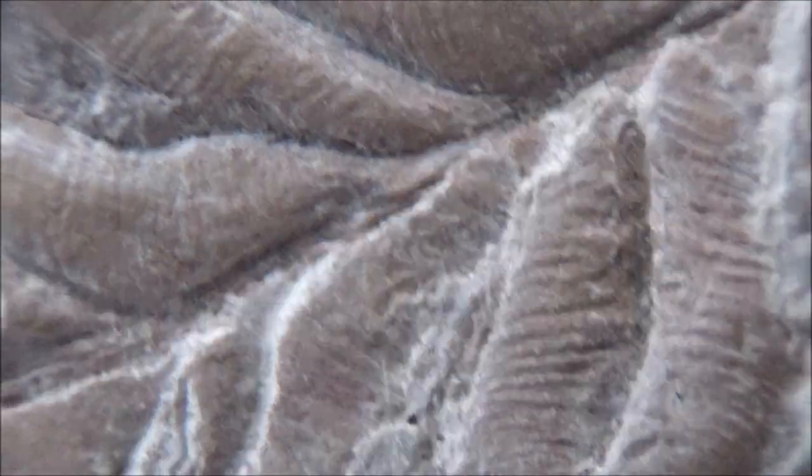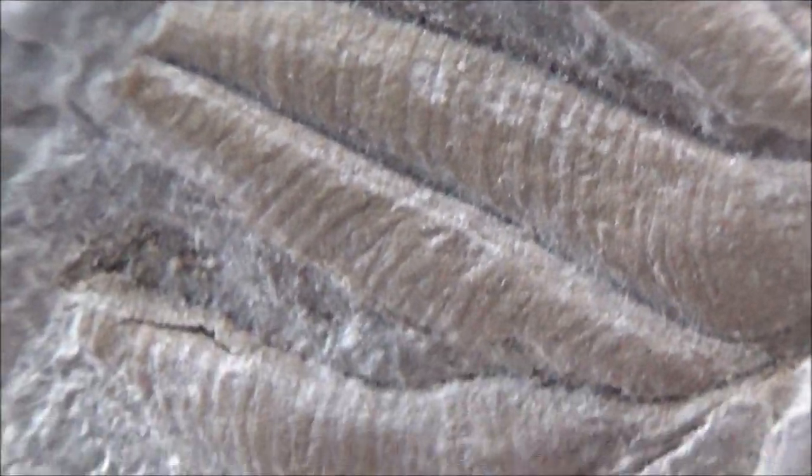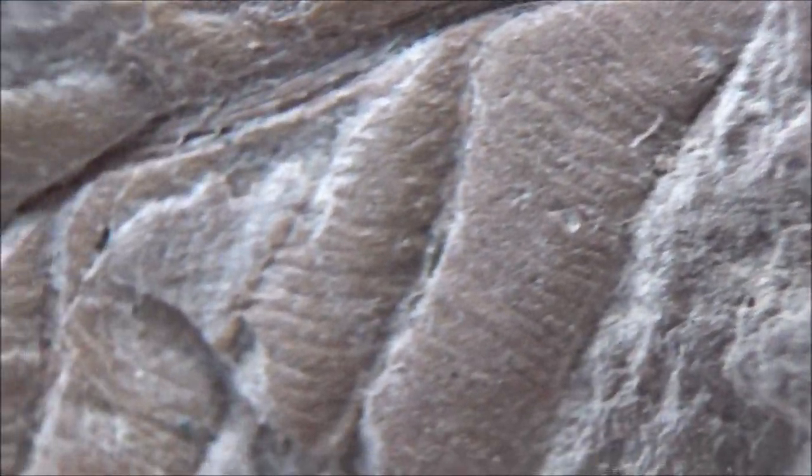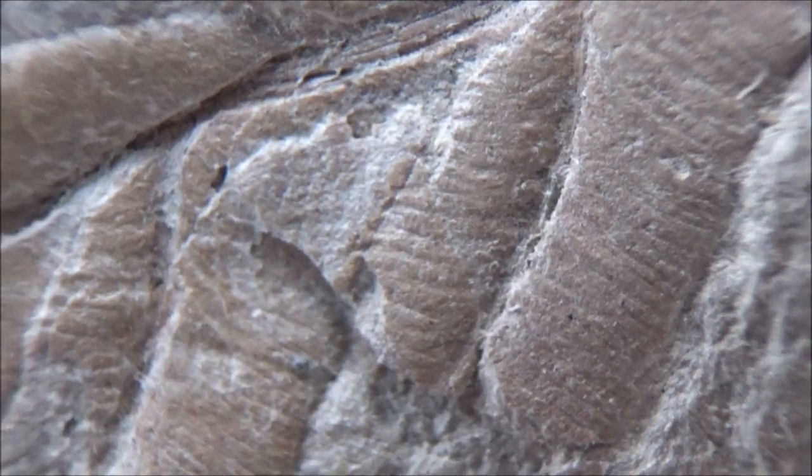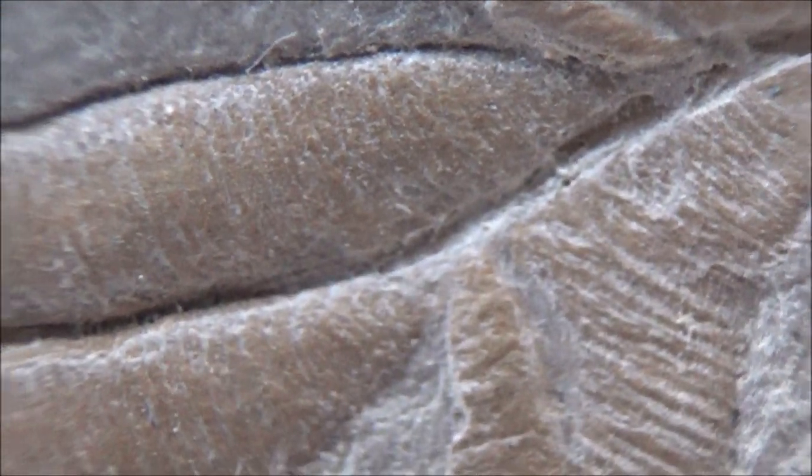The imprints of plant leaves from coal mines were also interesting. Although no cellular structures were preserved under these circumstances. A bit disappointing, but you never know what you're going to find if you travel in the micro world.